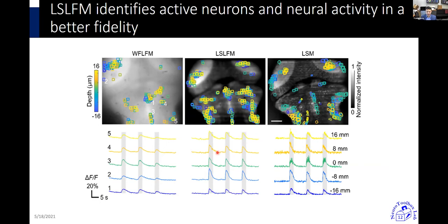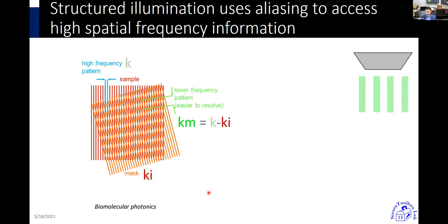And we can find some calcium activity from these cells when we stimulated the fish auditory pathway during the gray bars. Okay, the second one that I'll briefly describe is structured illumination. So today, maybe we can just focus on me.